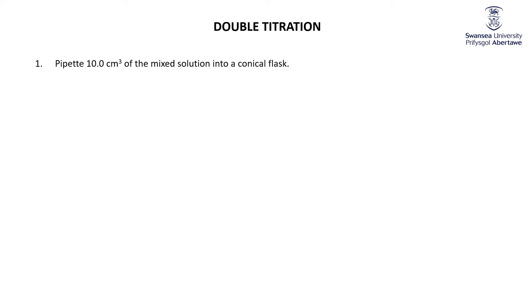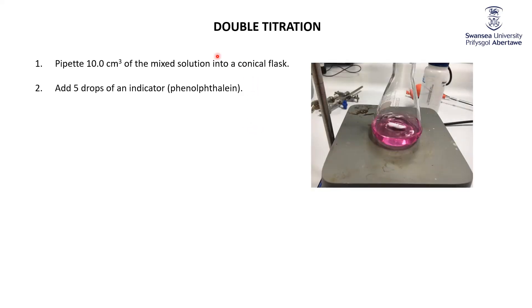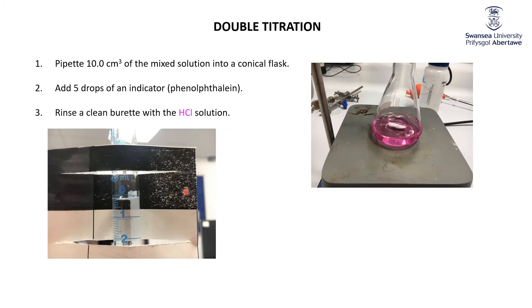First of all, pipette 10 cubic centimeters of mixed solution into a conical flask and add phenolphthalein. It's very basic because we have the sodium hydroxide and the sodium carbonate — phenolphthalein turns pink in a basic solution. Rinse a clean burette with the HCl solution. We're starting off here with about 0.2 millilitres at the start.